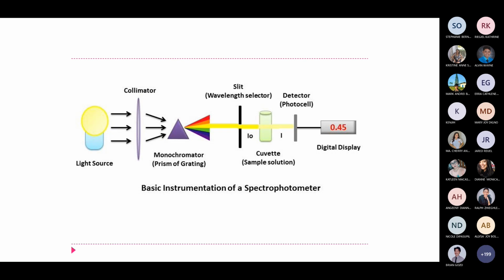of the light beam. And then itong photodetector cell naman, review, it converts, ano kino-convert niya? Yung light, syempre nag-pass through dito, di ba? It converts the light to electrical energy output or electrical energy. And then yung nakikita nyo yung display, that is the galvanometer or the readout device.